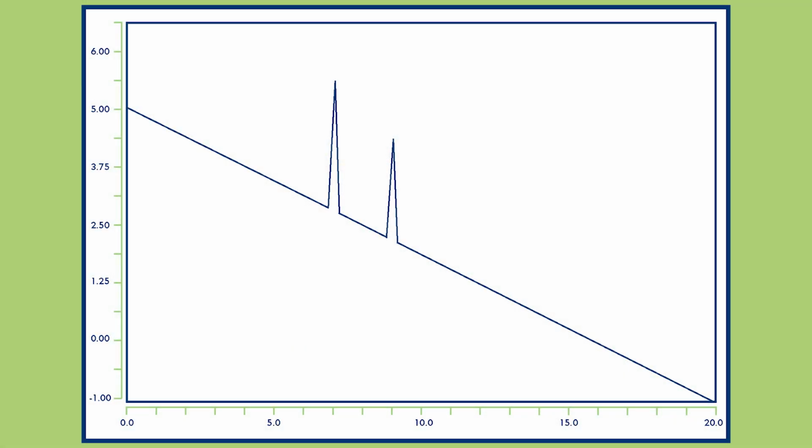The first thing that you should do is check the analysis of the data. Take a look at the raw chromatograms and make sure everything looks right. Here are a few things to look out for. First are baseline shifts. If you're not running a solvent gradient, the baseline should be completely flat. This includes things like periodic waves in the baseline that could indicate issues with the pump.